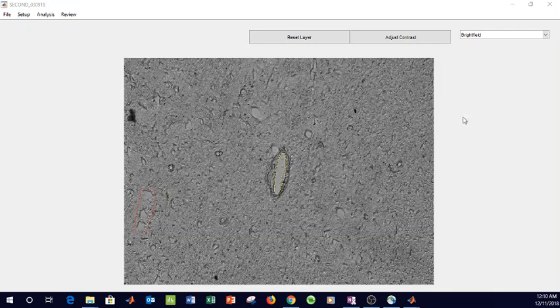Okay, we'll select OK. And again, we need to find our data. In this case, rather than selecting images or folders of images, we're going to select the folder that contains the folders, if that makes any sense. So in this case, we're going to select demo.